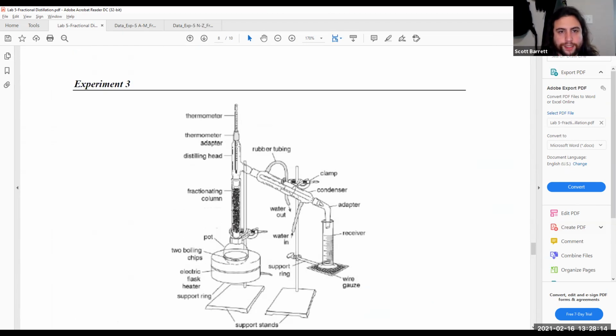This here, as you see the still head or the distilling head, is where the condensation will occur. The thermometer is kept up here, so that you can see what the temperature is up here at the distilling head, at the still head. And the still pot should be relatively close to what the heating mantle's temperature is. And so when we look up here at the temperature, we can tell exactly how hot it is up here relative to the temperature down here at the heating mantle.